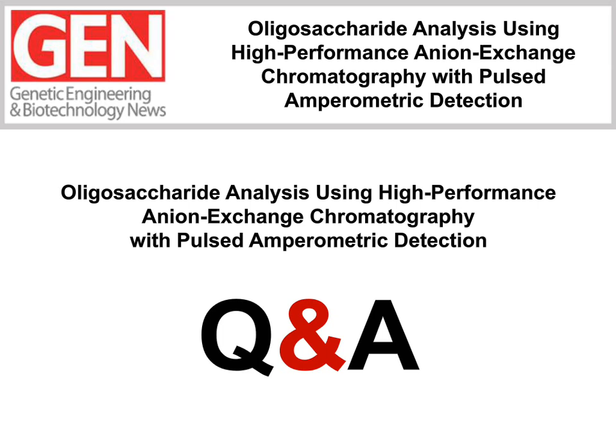Now, if we change the electrode, we have a couple different other working electrode options for that detector. We can have a glassy carbon electrode that's been used for compounds like catecholamines. We also have a silver electrode where we can detect things like iodide, bromide, a number of other compounds that are escaping my memory right now. And then we have a platinum electrode where we can do alcohols and glycols. Now, in those cases, we're going to obviously switch the column and generally switch the mobile phase, but that can all be done on the same chromatography system.